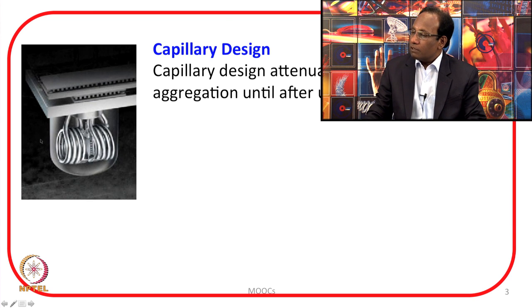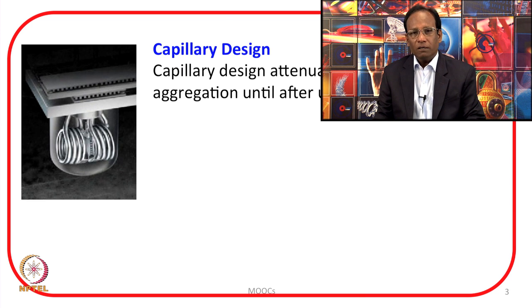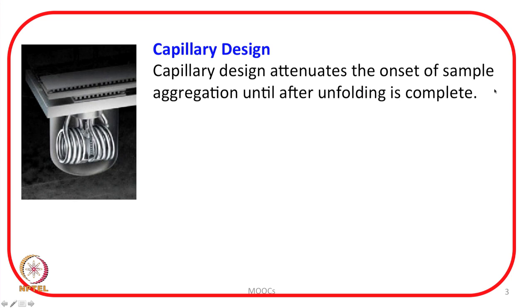So, this pair of sample and reference cells of capillary design is the most suitable for biological systems. And that is what is commented over here, that the capillary design attenuates the onset of sample aggregation until after unfolding is complete.